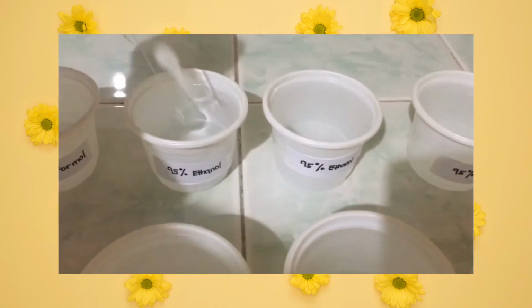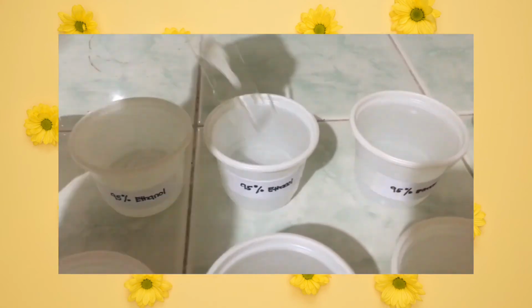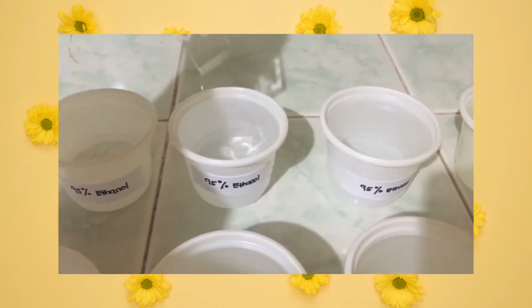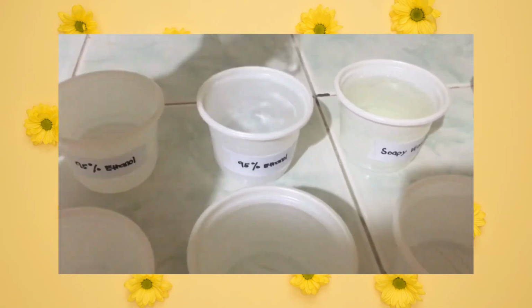After that, immerse the slide in a 95% ethanol. Again, in this process, there will be 3 changes of dipping with the same reagent. Each must be submerged 10 times.